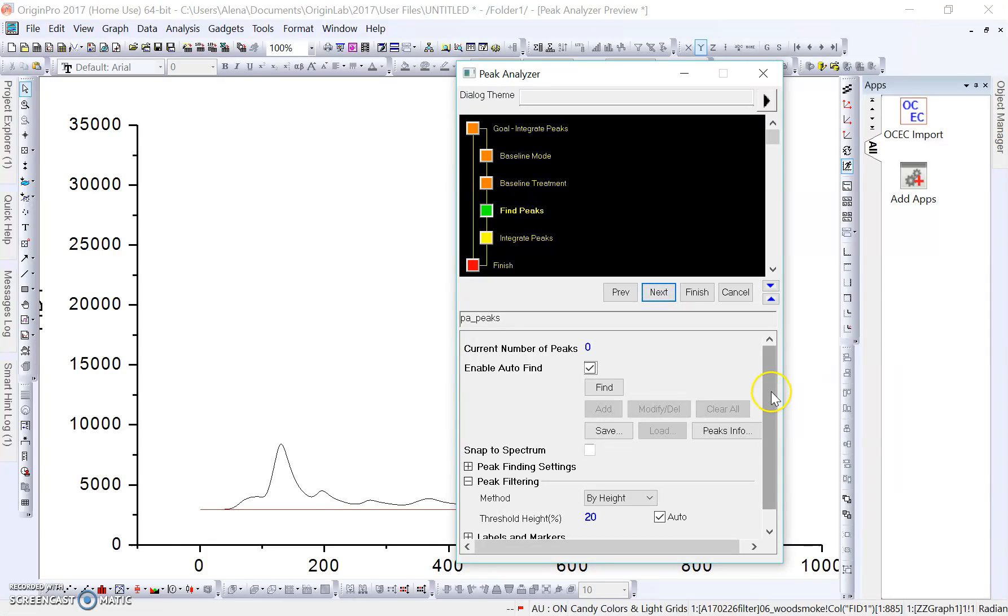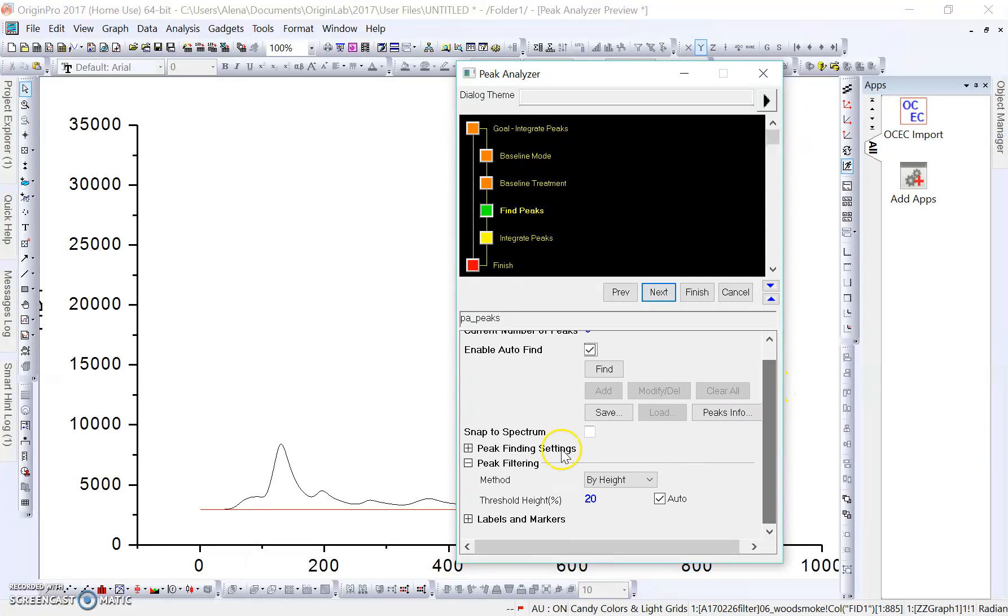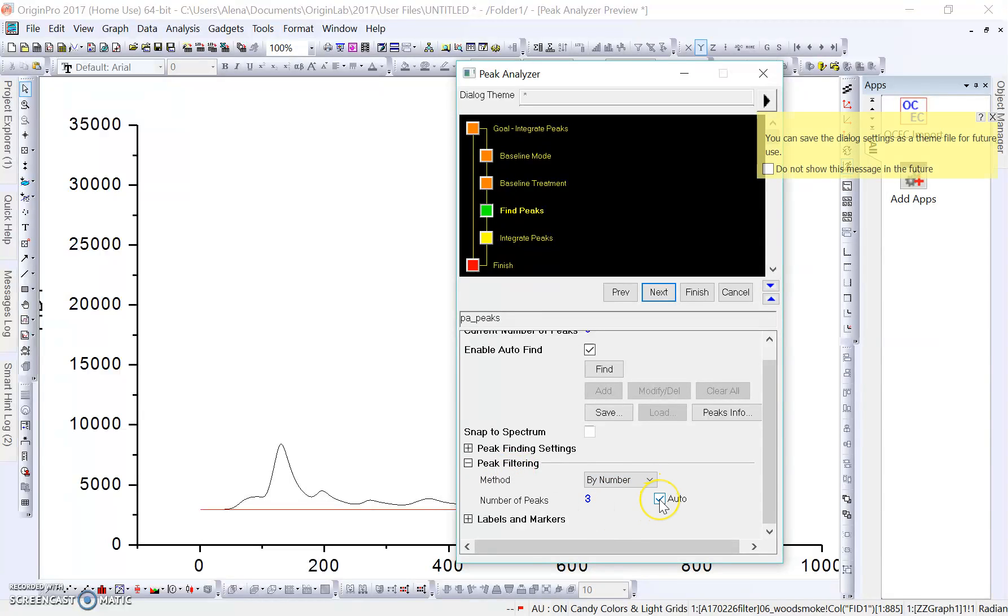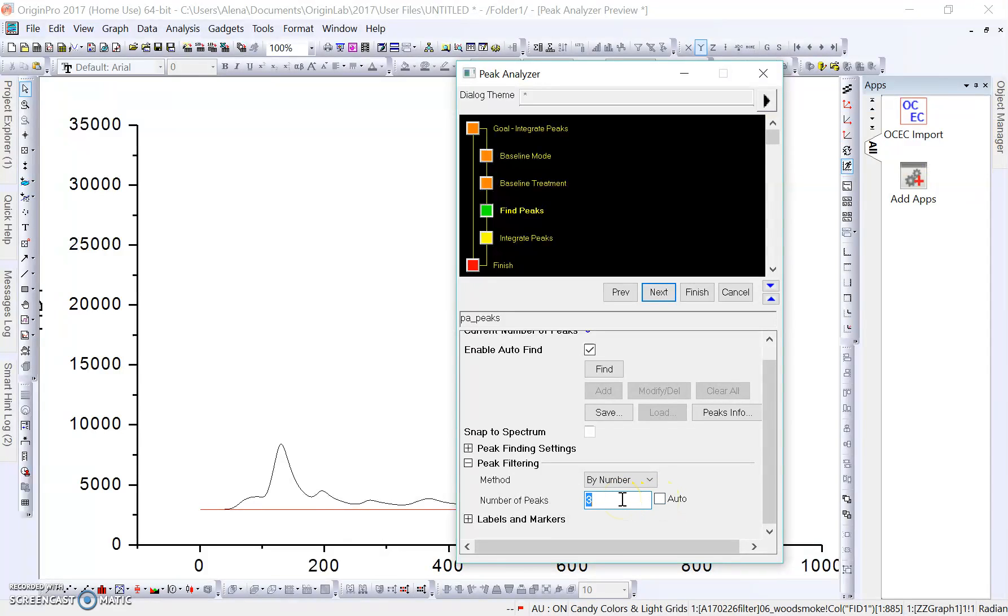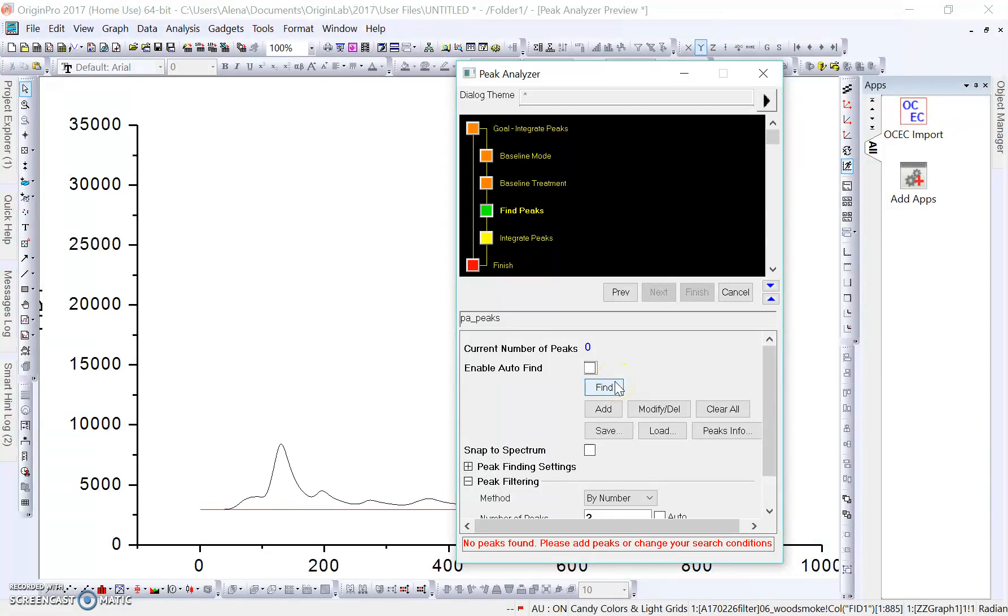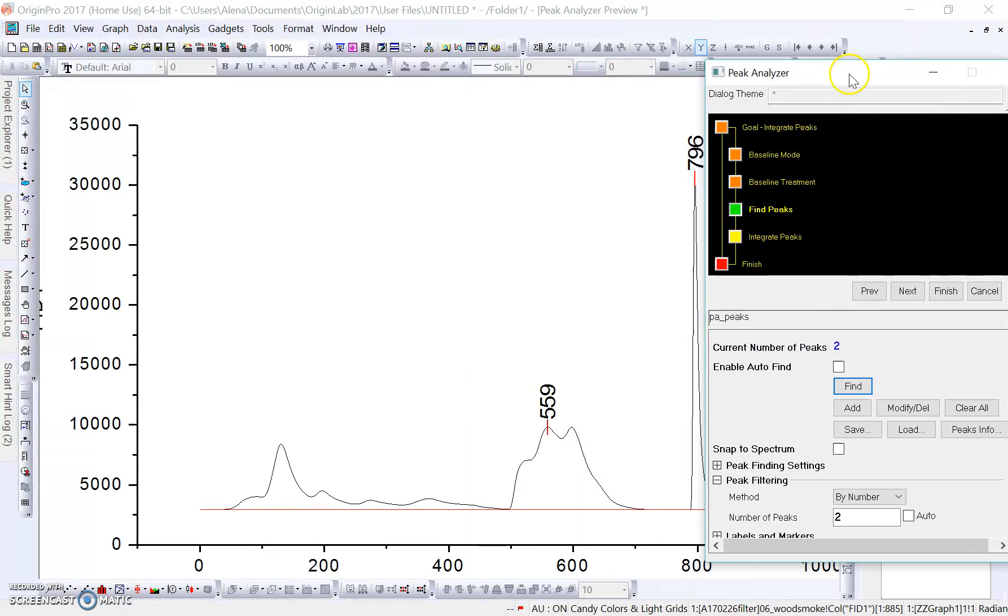This is finally where we want to start editing stuff. If we look down here where it says Peak Filtering, it says the method by height. We're actually going to switch this to by number, and we're going to unclick Auto. In this case, I only want to find two peaks for this method I'm going to create, so I'm going to click on two. I'm going to get rid of Enable Auto Find because that will not allow us to find peaks later on if we continue to use this method. But I will click here Find, and it's going to find the current number of peaks on our graph, which is two.